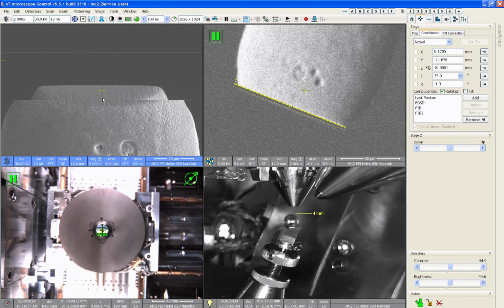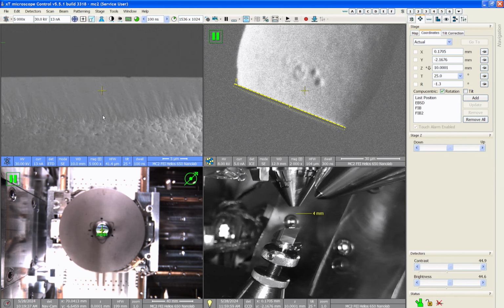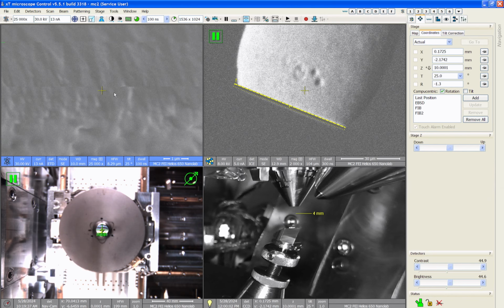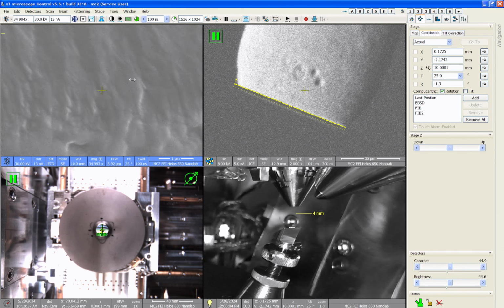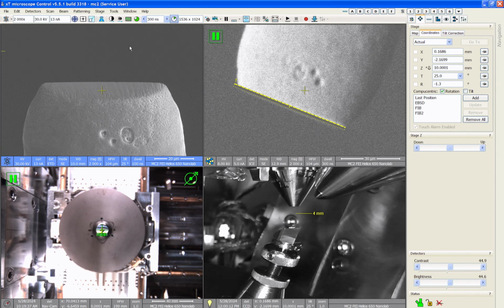All right, so I have my SEM image here already. Again, I saved this position, so we're right here. I'm going to zoom, focus a little bit, make sure my astigmatism is adjusted. Now I want to make sure that the SEM is going to focus and follow this plane. So I'm going to turn on dynamic focus.